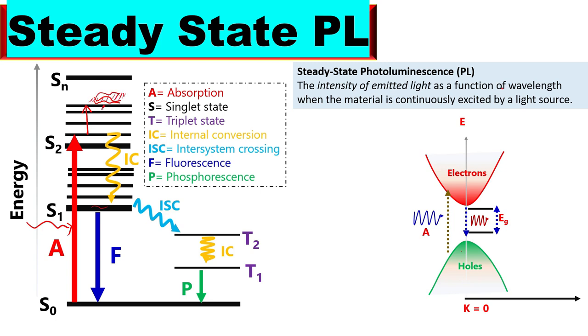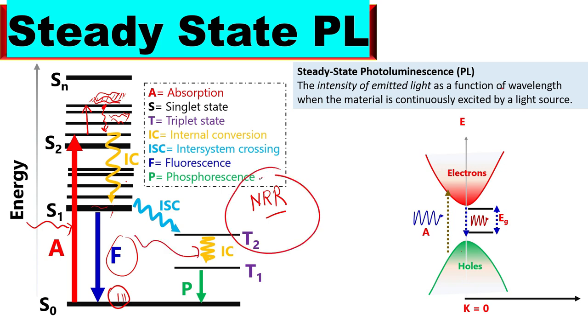So here the electron is basically lost because of those defects, and we do not get any radiation. Here we basically get heat or phonons. This is why it is called non-radiative recombination, because the electron does not recombine with the hole. In the other case, we will have fluorescence, which is called radiative recombination, because the electron recombines and we get photons. Non-radiative recombination means that we do not get any radiation, but we lose the electron.